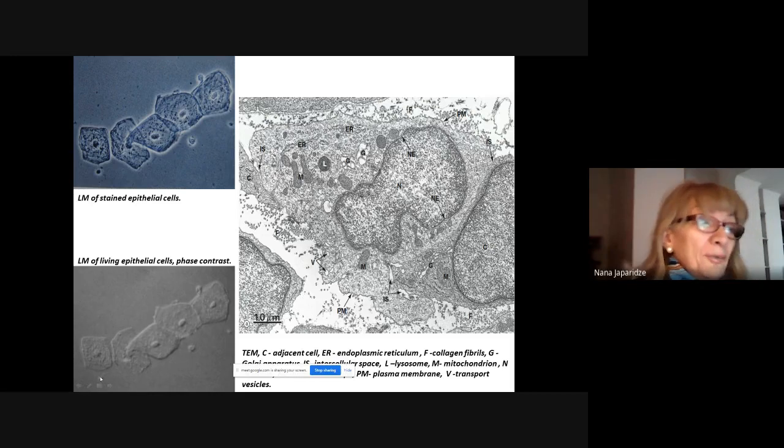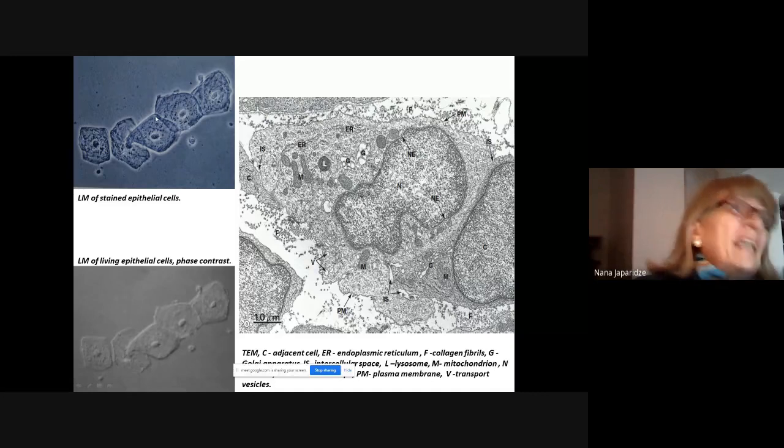So we provide the growing of the cells, maintain their viability in petri dishes, and observe them in artificial medium. But here the cells are first of all fixed, and then they might also be sectioned, but these cells are not sectioned, they are fixed and stained.